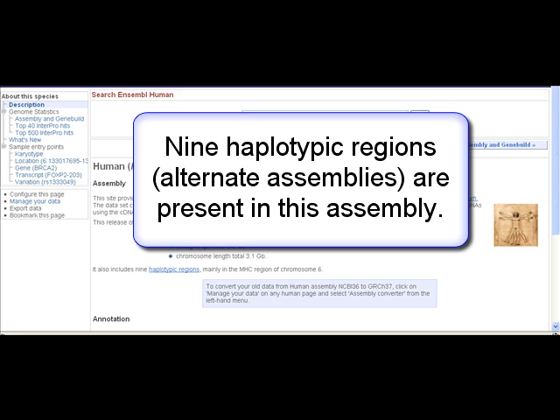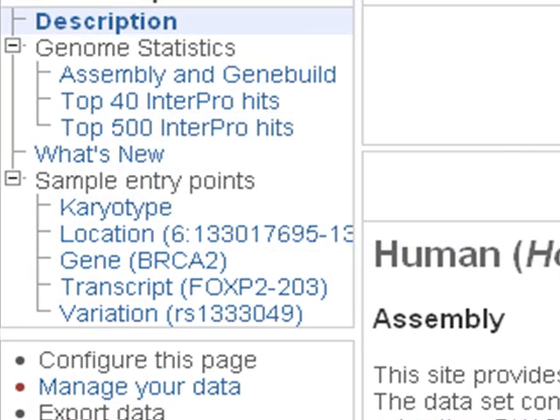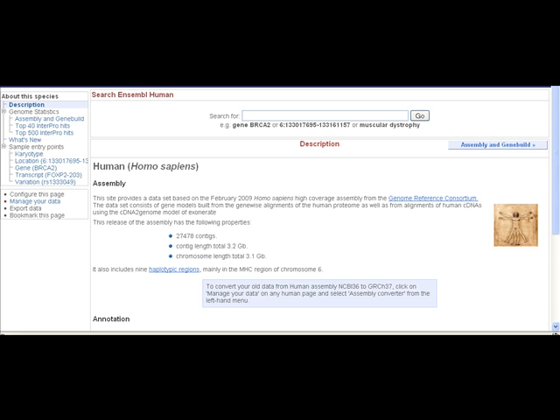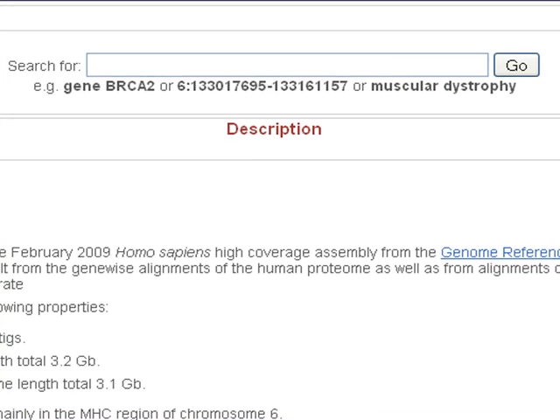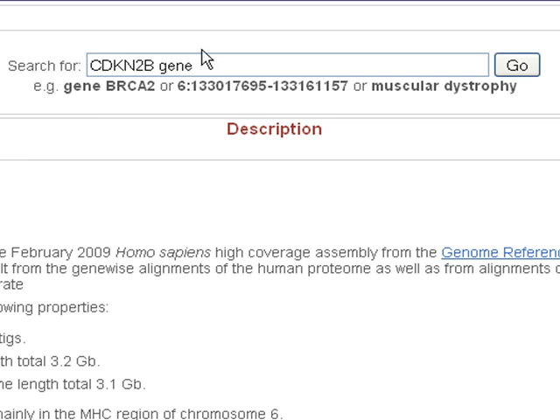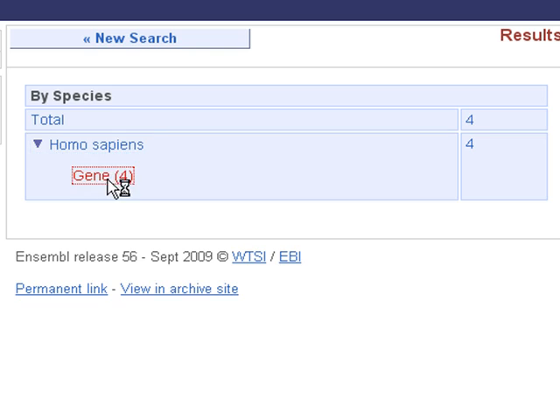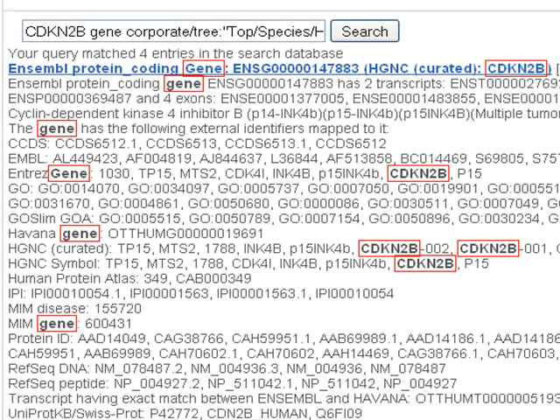Links on the left-hand side show statistics and dates for the gene build. We can also reach the karyotype. Now we will search for a gene by typing 'CDKN2B gene' at the top of the page and clicking go. Let's expand Homo sapiens and gene, then click on the first hit to go to the gene summary page for CDKN2B.